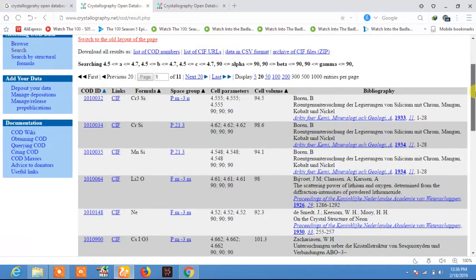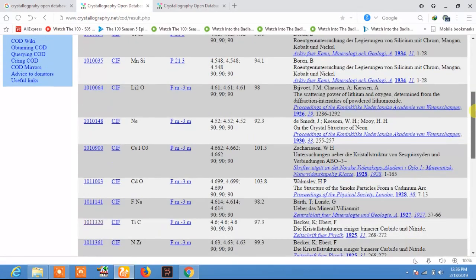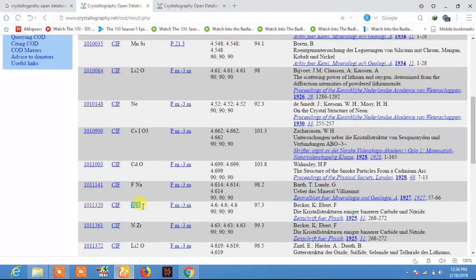Here you see a large number of files which have similar structure parameters. For example, Cr3Si has cell parameters of 4.5 Å and space group Pm3n. The material we are searching for is TiC, which has lattice parameters A = B = C = 4.6 Å and angles alpha = beta = gamma = 90 degrees.